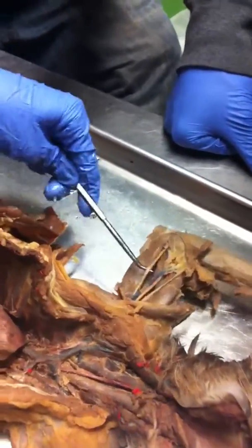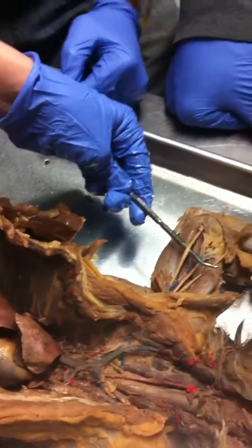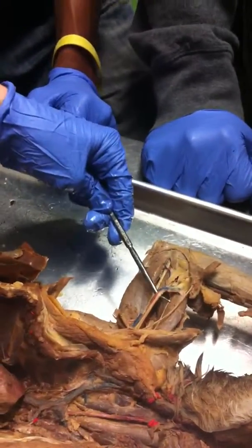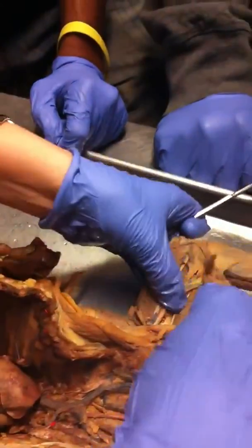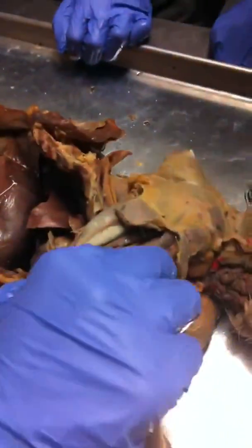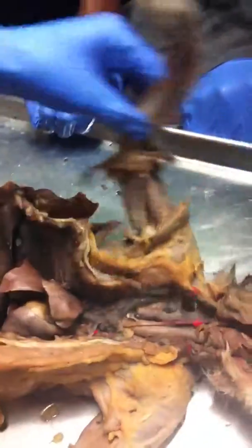Alright, so we've got the ulnar nerve here on the bottom. Median nerve would be in the middle here. And then the radial, and then I think this is the musculocutaneous. And then the radial nerve, big one, is this. There's the front of it, and then it all continues onto the back to be right here. That is thick.